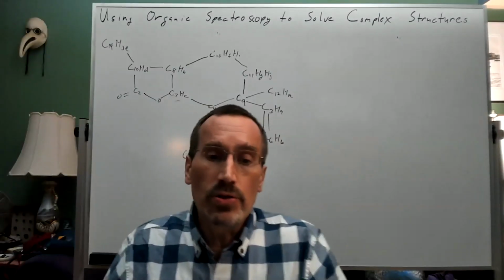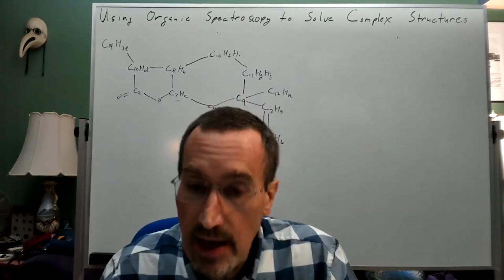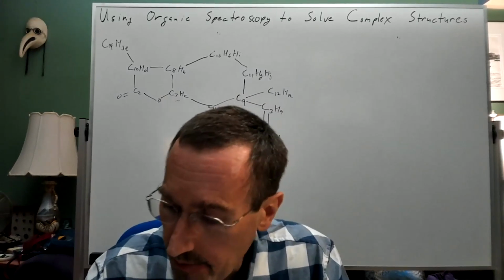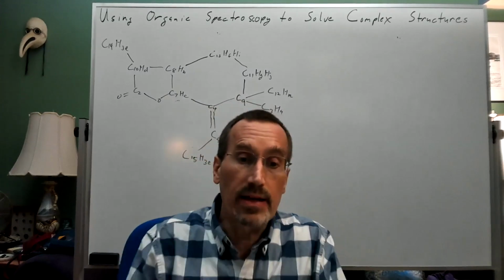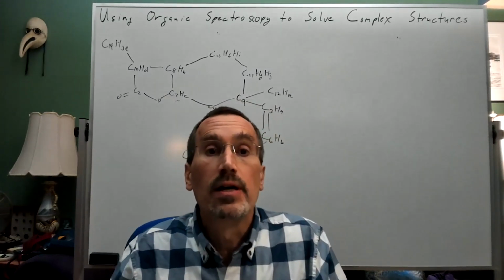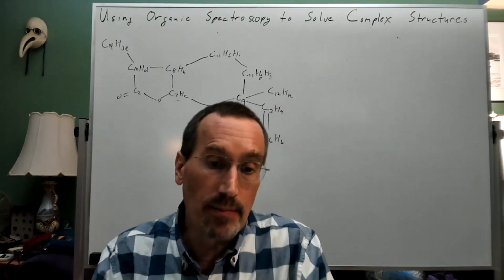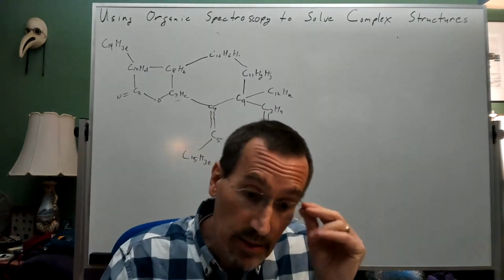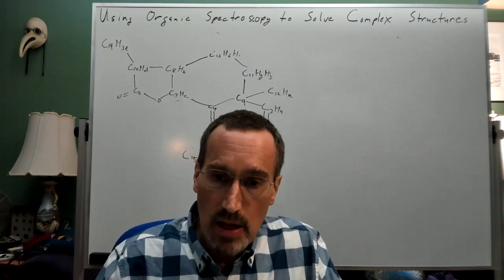Well, I wanted to pick up where we left off this morning to finish up with this homework problem and the structure determination. So I think where we left off on the problem, we had elucidated the aliphatic portion of the molecule primarily by COSY.